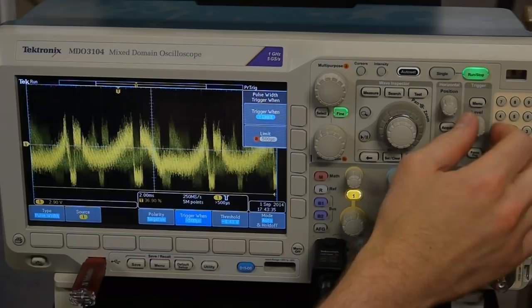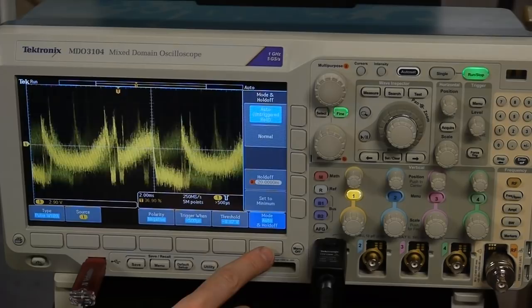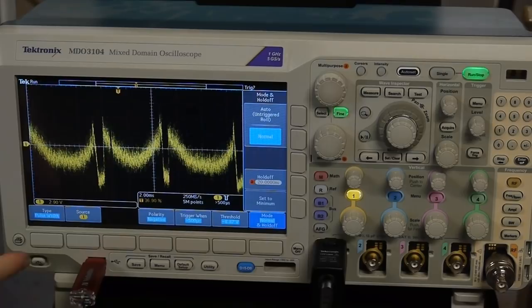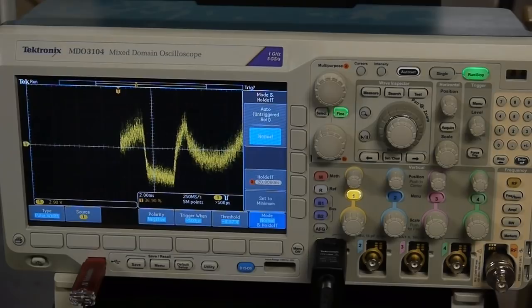And if I set the level properly, you'll notice that it's actually not triggering. What's going on? Well, the vertical sync pulse is so infrequent, it only happens once every 10 seconds. The scope has gone into its auto trigger mode. So we'll change this to a normal trigger, and as you can see, the scope is not running right now. It's a trigger with a question mark, meaning it hasn't gotten one. However, if you watch here, it's going to trigger now, and that was because the microscope just started a new frame.